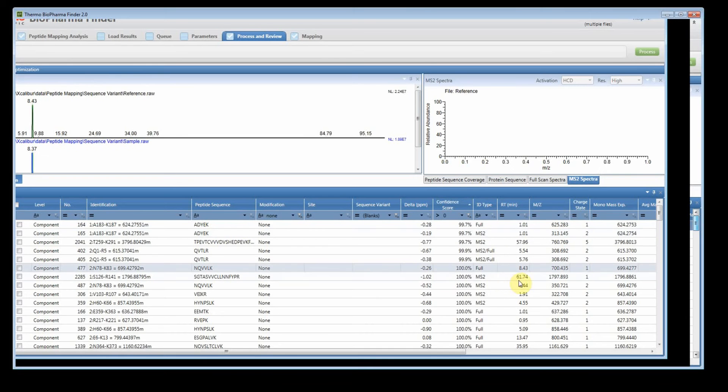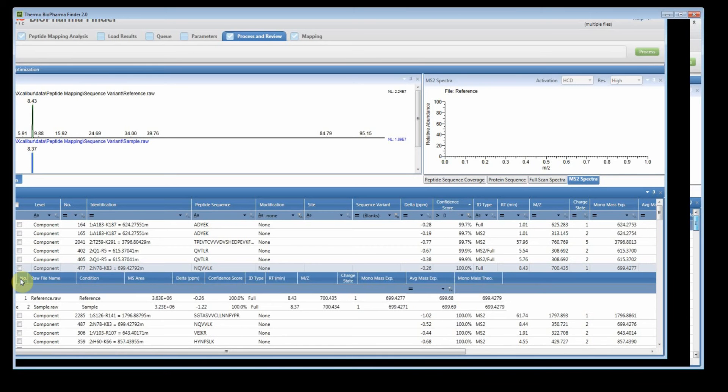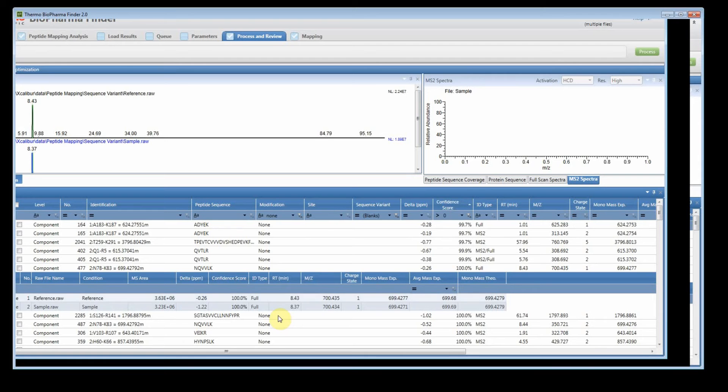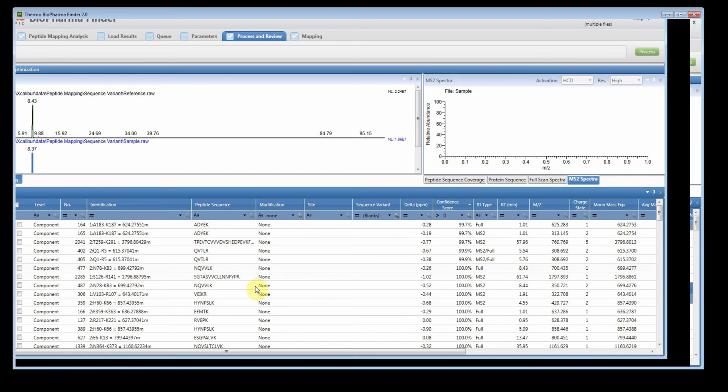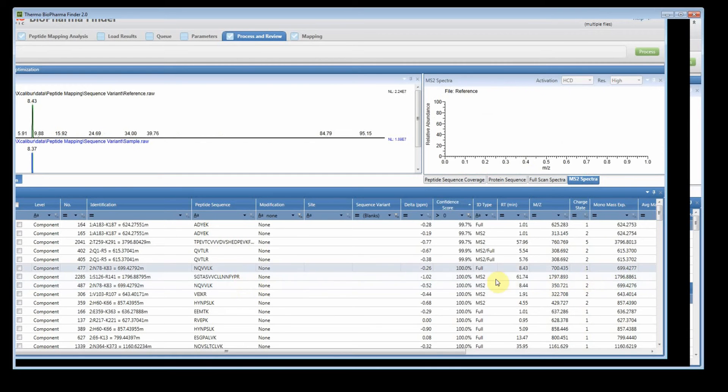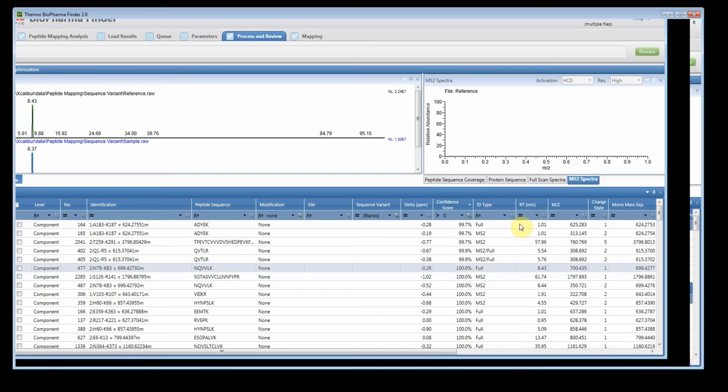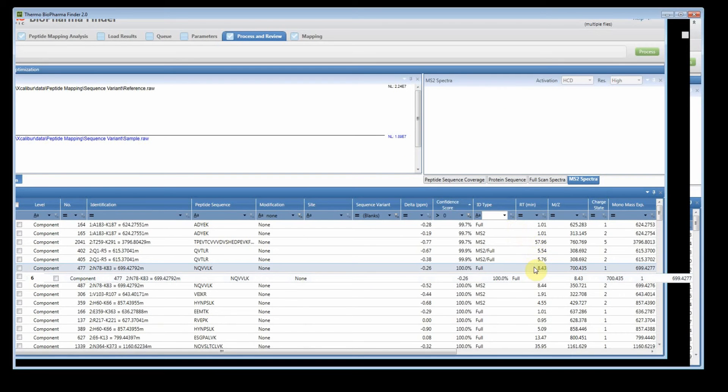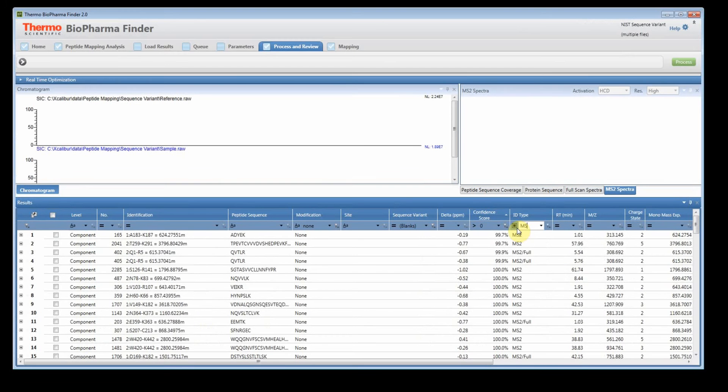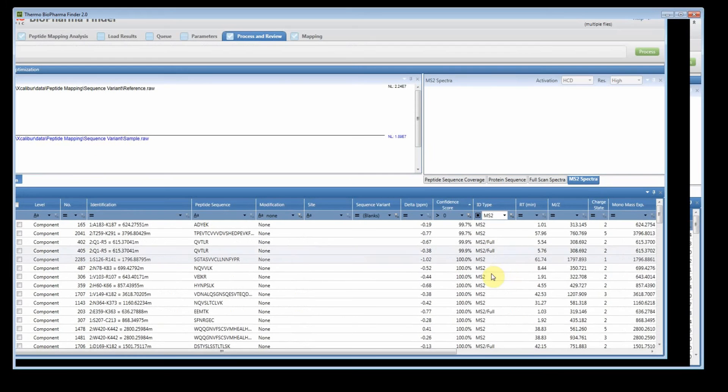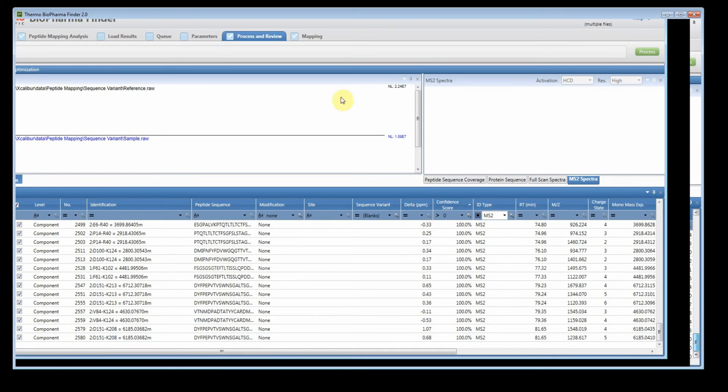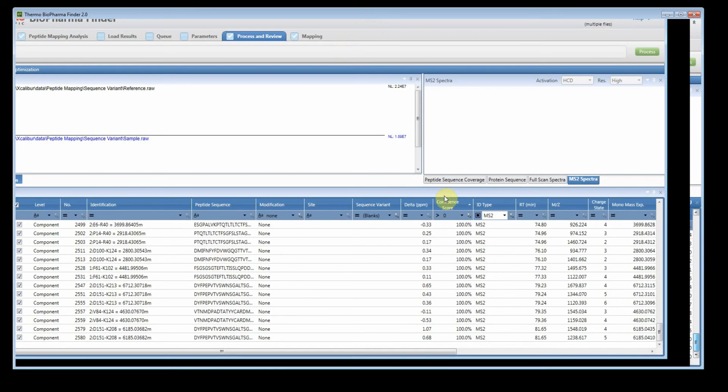Now on this one, you'll actually see full scan. Now that might be coming from under here. This is probably a push. There's a relationship. So sometimes the software will push if it actually has an MSMS. So this right here, this version has an MSMS, and so it's pushing it to there. That's why you'll see that. You could exclude other full scans by doing contains MS2. So now everything has an MS2. So let's check this. Go down to the bottom, 112, and let's go back.